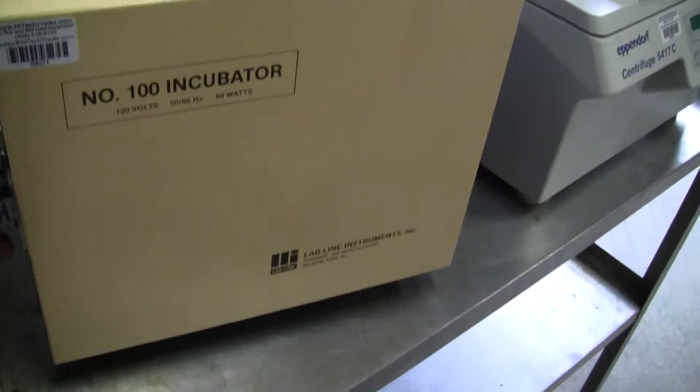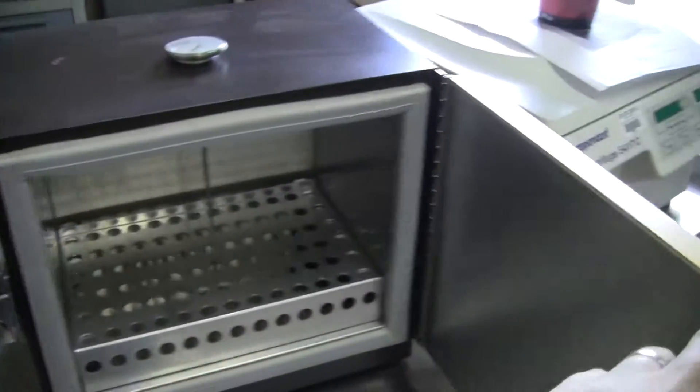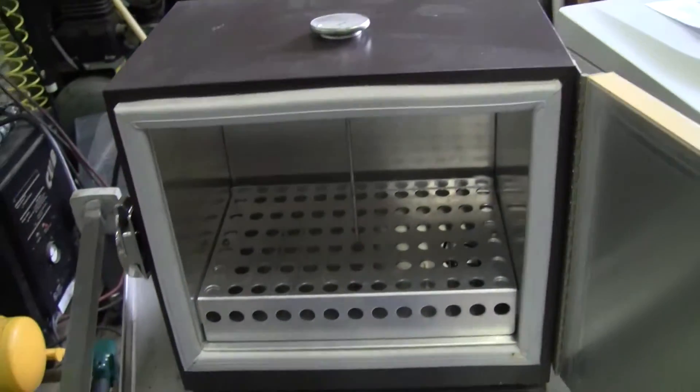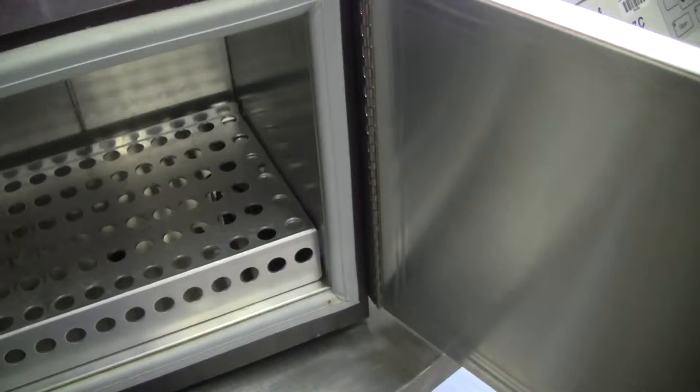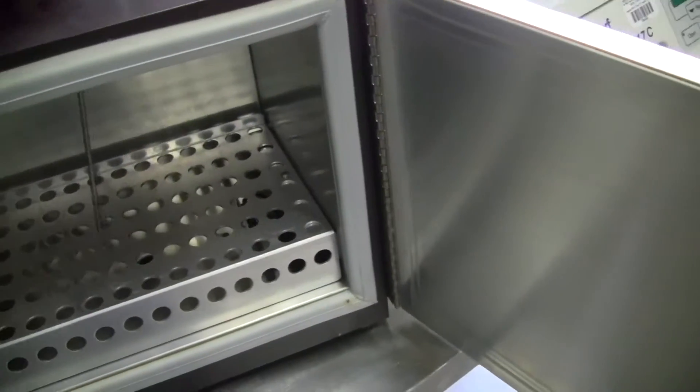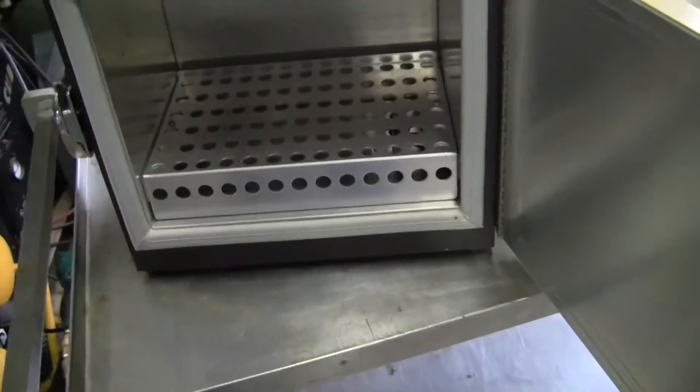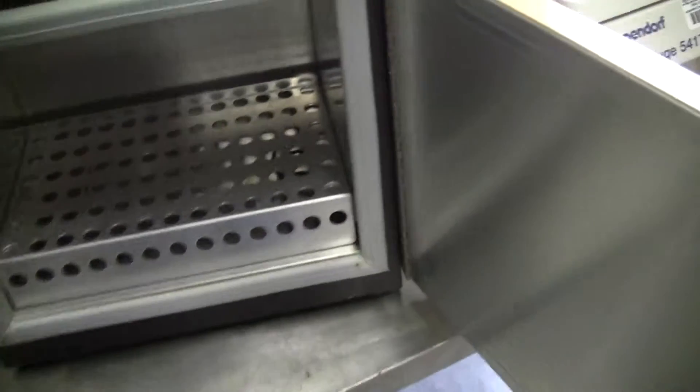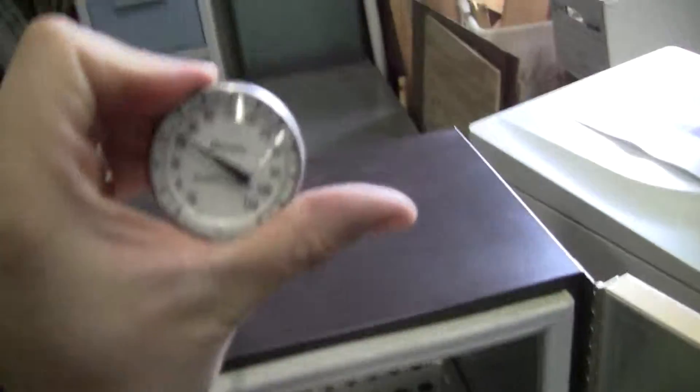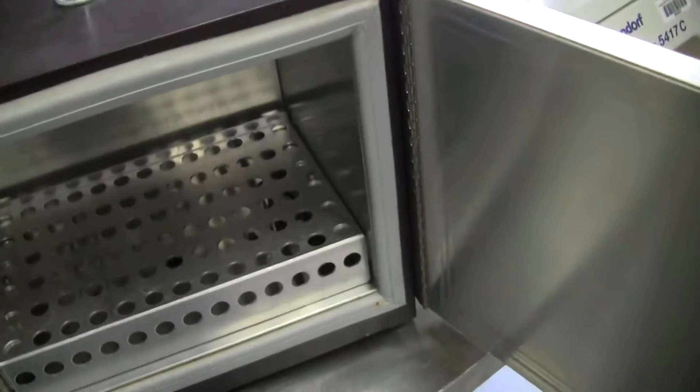This particular incubator is quite small and quite cute. Inside, this is our test thermocouple, this does not come with it. It's a little too large for this device, but as you can see I have it ramped up to about, it's dropping in temperature now, but I had it ramped up about 30 degrees.